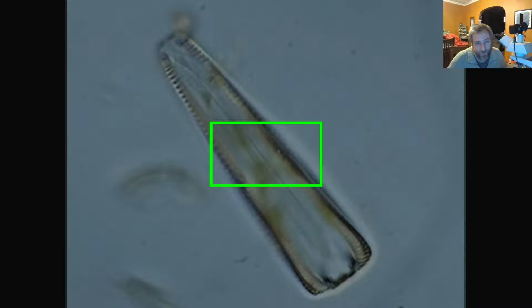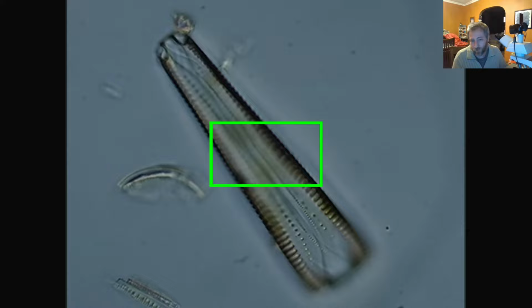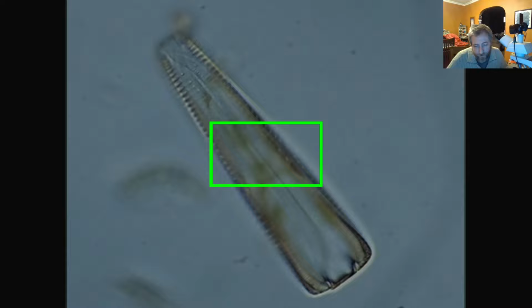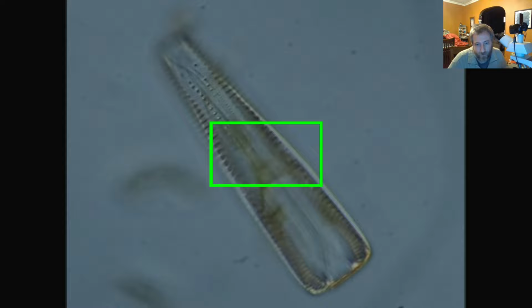Again, this is in girdle view, so both valves are visible. You can also see a characteristic shape for gomphonema: the distance between the valve faces is a little bit larger at the bottom of my picture than at the top. If we rotate through the image, the front end of the gomphonema has a prow, like the front end of a boat. On a boat it's up, but on the bottom one it's coming up. So it has a prow-like structure on the shape of the valve, like it curls outward and upward on the one end.